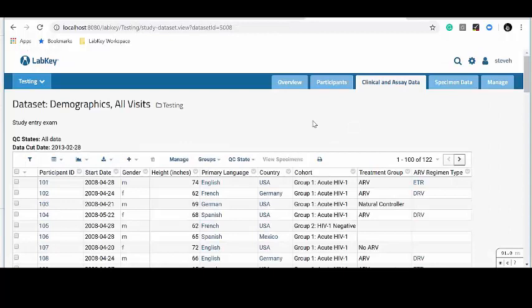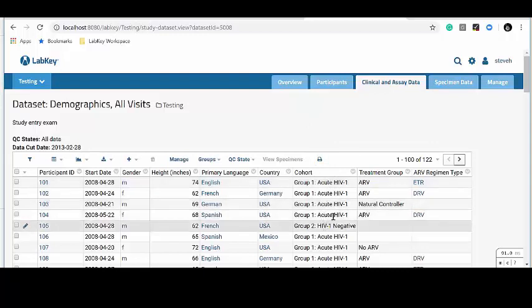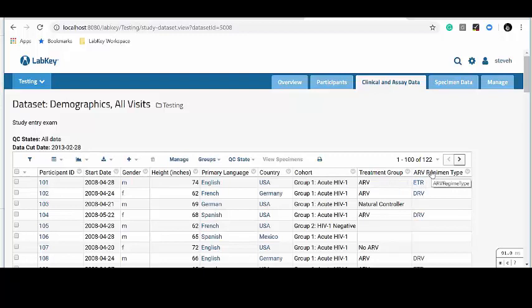I've also set up a number of really important dimensions inside of this data. For example, this column here tells me whether a patient is HIV positive or HIV negative. And these columns here tell me whether they're receiving treatment and what kind of treatment they're receiving. I'd like to be able to compare these different groupings or dimensions against one another to see how my patients are doing. Let's go on to the second part and see how you can connect LabKey Server with Tableau.